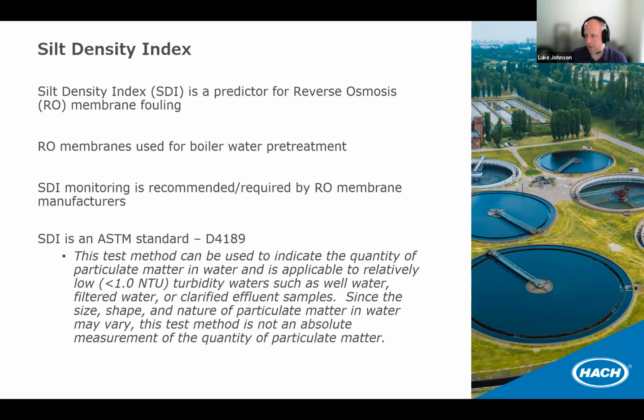And one of those is particulate fouling. So SDI as a test measures all of those combined, sort of, and turbidity can be useful for monitoring one of those fouling mechanisms without a lengthy manual grab sample kind of test, which is what SDI is.